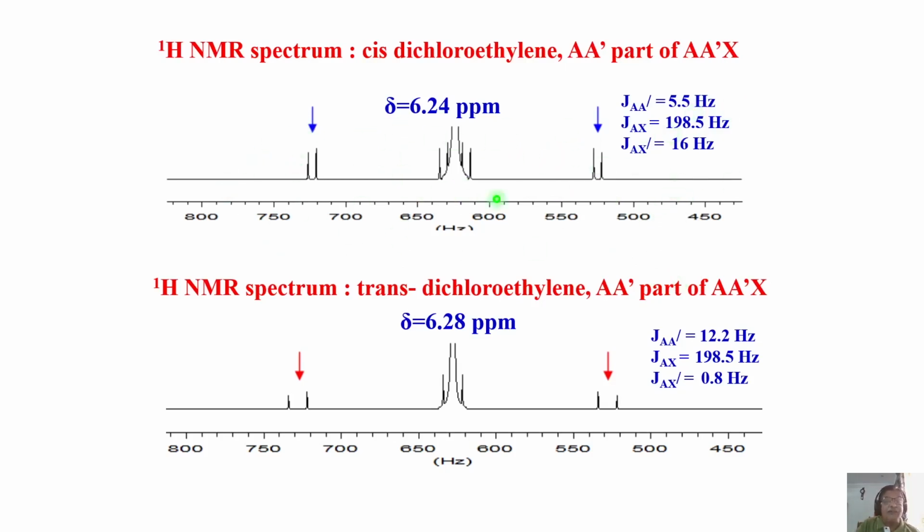Remember, the spectrum of carbon-12 attached and carbon-13 attached are all overlapped, but in the normal course you don't see it. But if you want to analyze, enhance the intensity. That's why this peak is cut. You have enhanced the vertical intensity so that these small peaks are seen. Now you analyze the satellite, you get all the information.